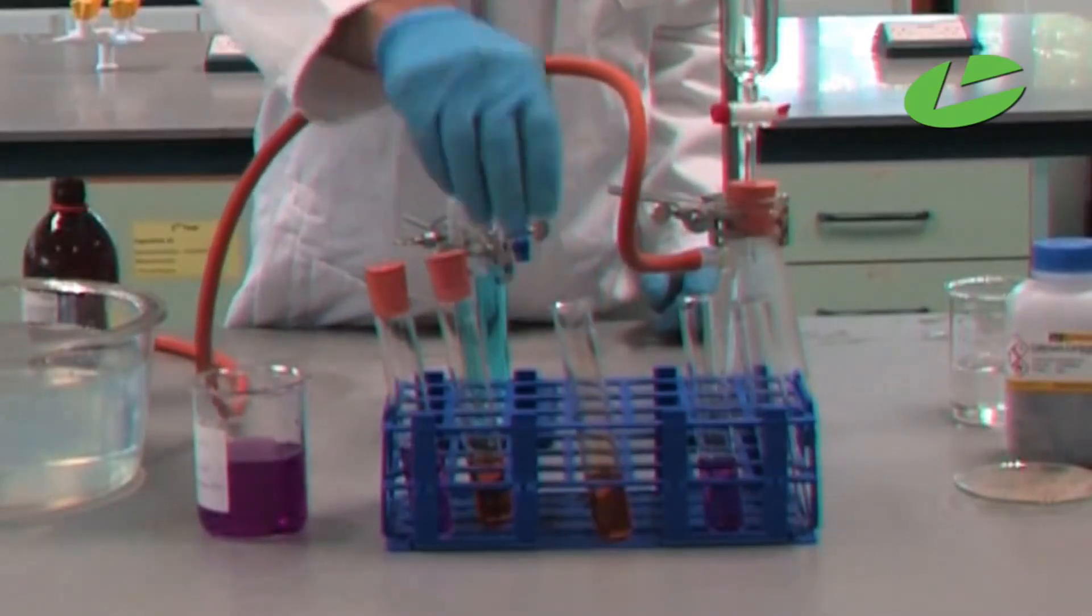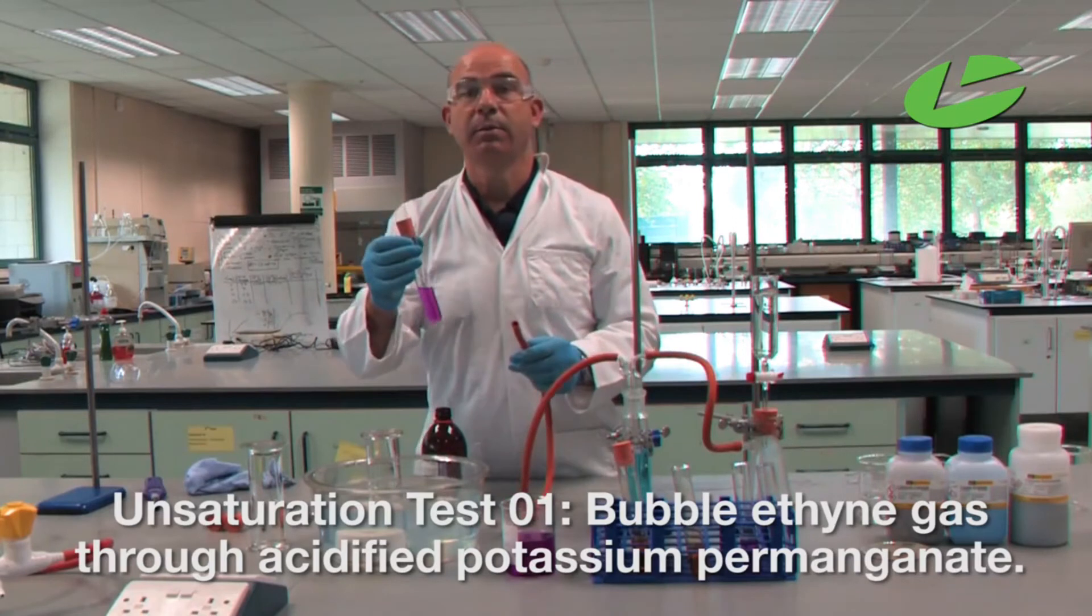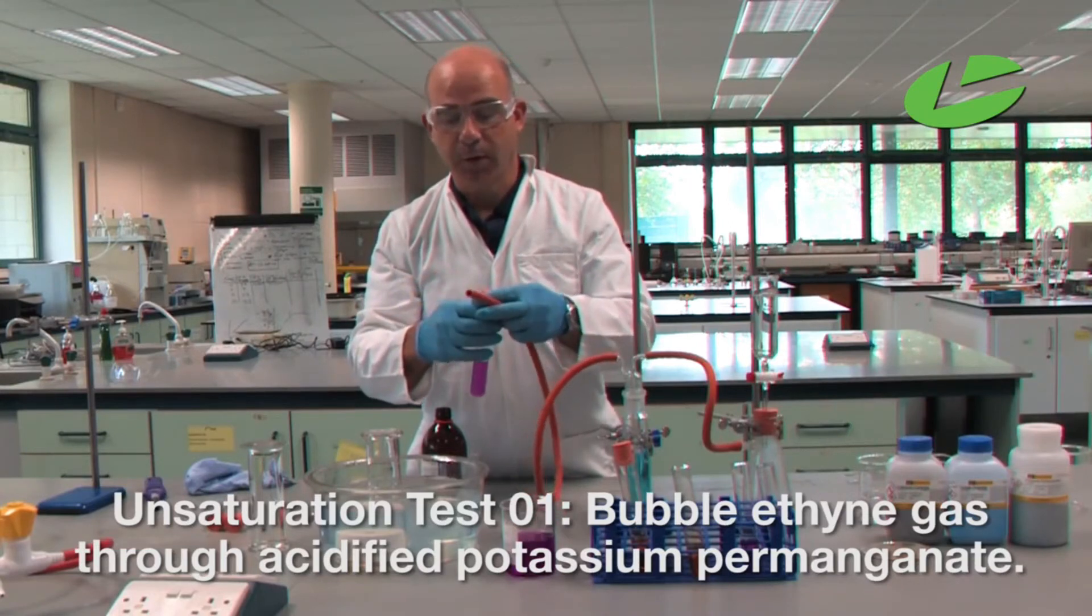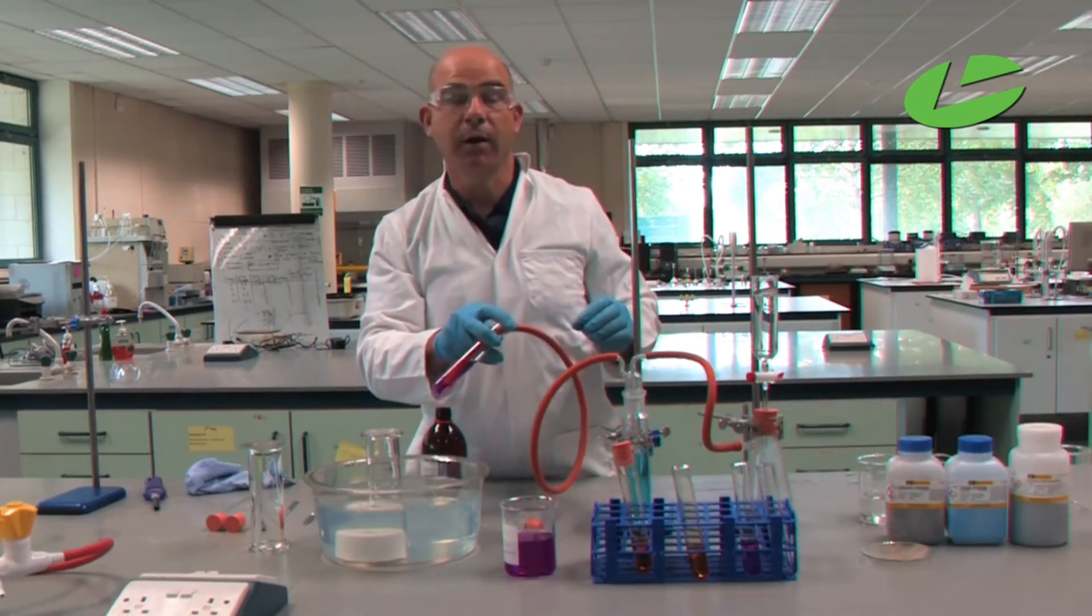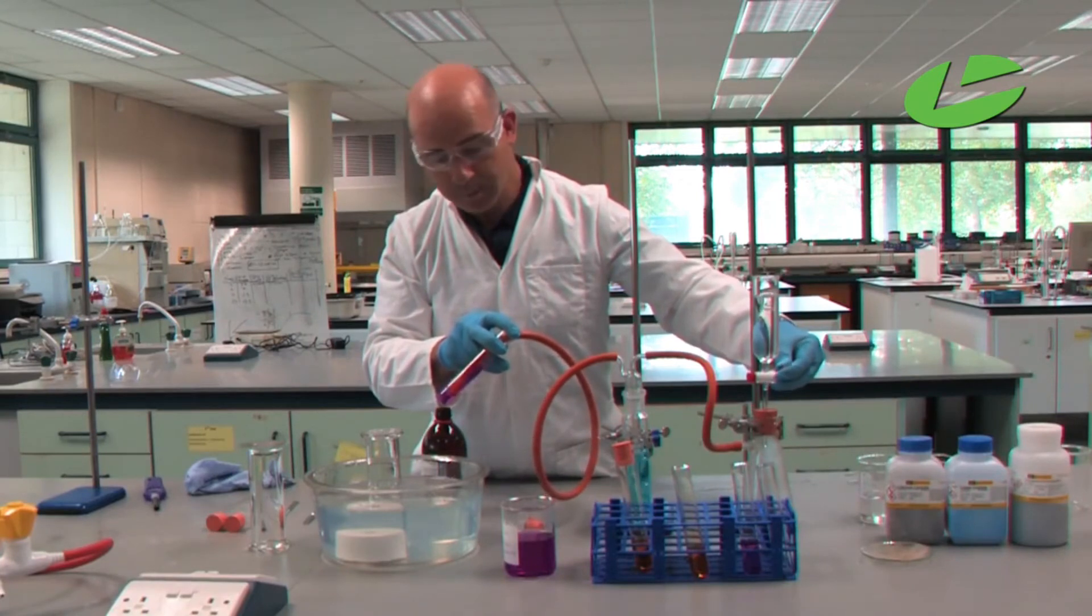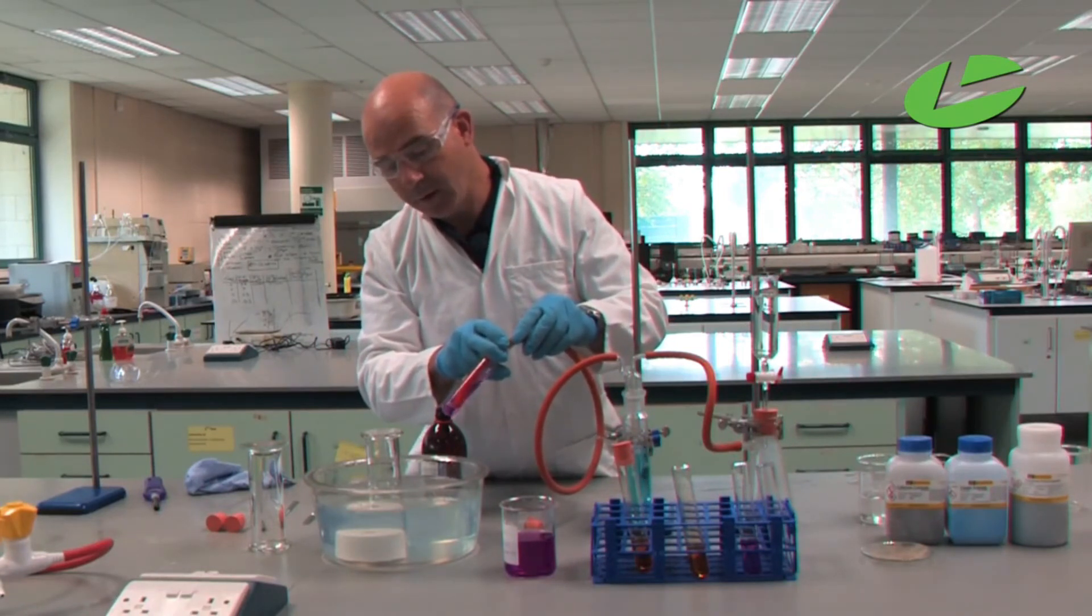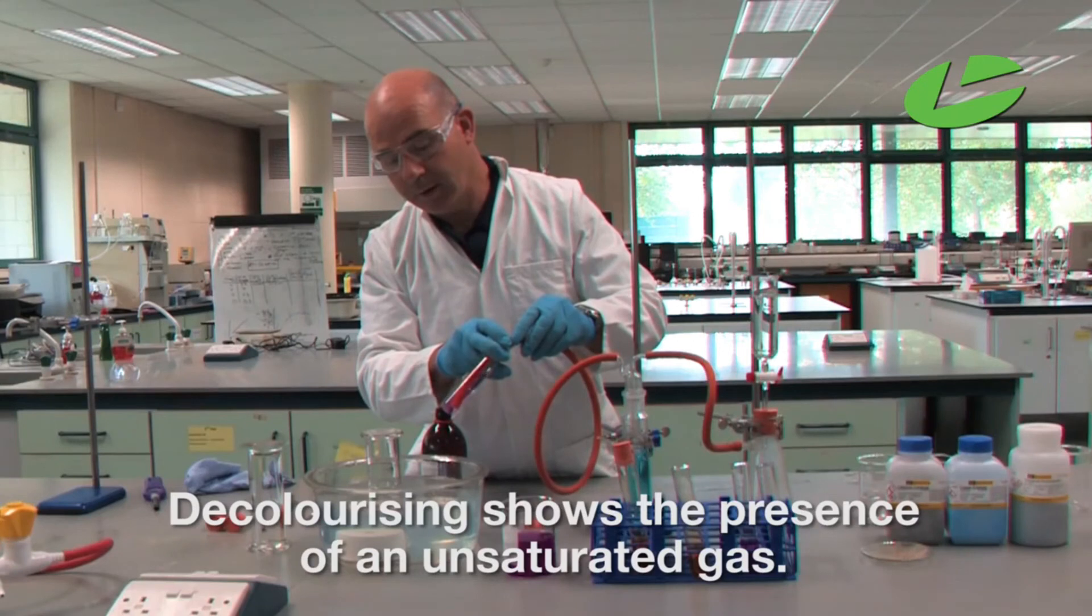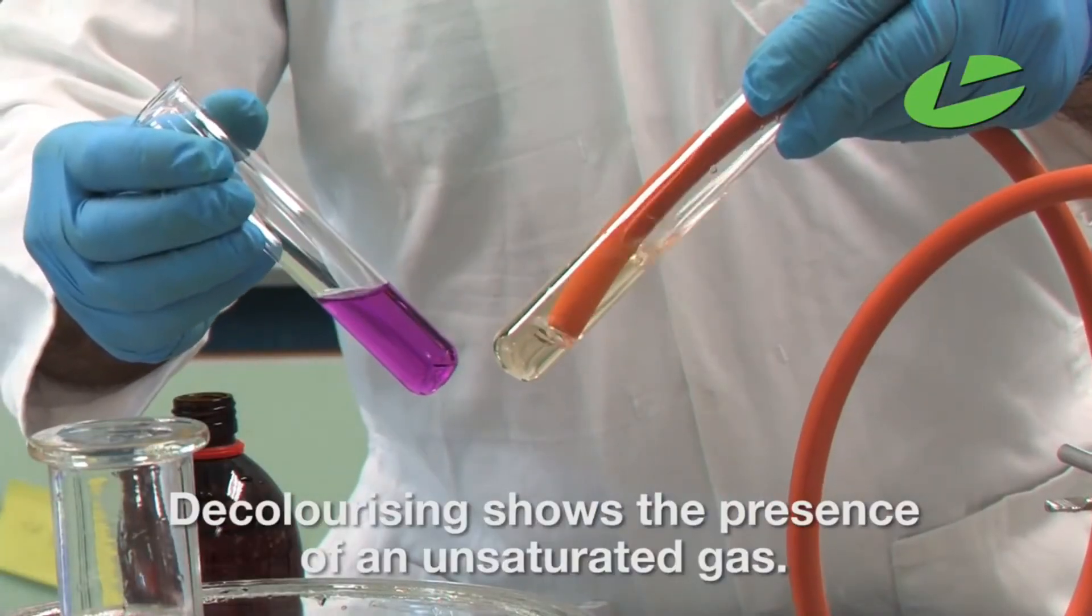In this decolorization test, bubble ethyne gas through the acidified potassium permanganate. The permanganate goes from +7 to +2 and gets decolorized. Open the test tube, put your tube into it, and if you have an unsaturated compound, you'll get decolorization. As the ethyne gas reacts with the permanganate, it turns colorless. You can see the advantage of having the before color ready - this is decolorizing in front of our eyes.